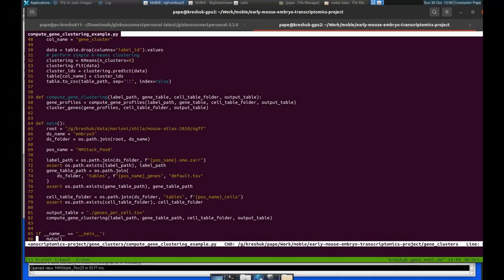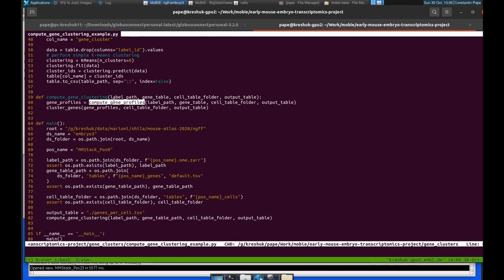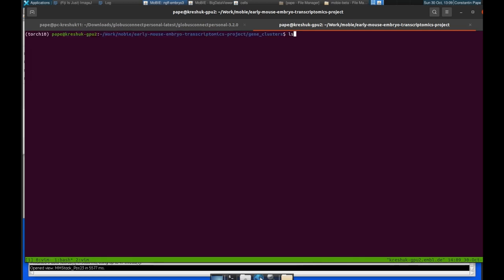So here we've swapped over to a terminal, and we're going to do some further analysis with Python. So the idea is we have this little function here, which will compute gene profiles, so it will count the number of gene expressions per cell, and then it will cluster genes. So it will take our cells and cluster them by that expression profile. So let's go ahead and run that.